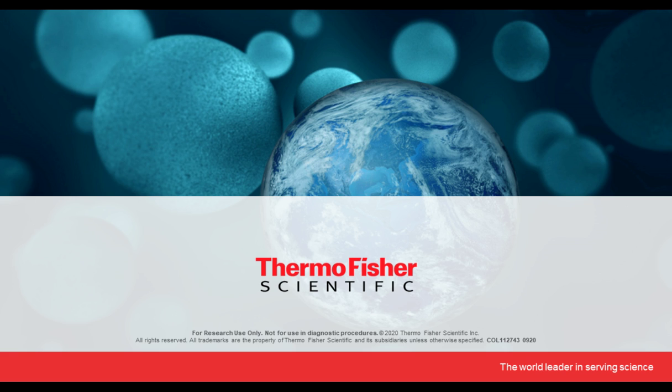Now, because lysine is so ubiquitous, what we have found is, most antibodies, when they are trying to look for a unique signature, they try to avoid these most common amino acids, right? So most target proteins really don't have lysine in the antibody binding pocket.